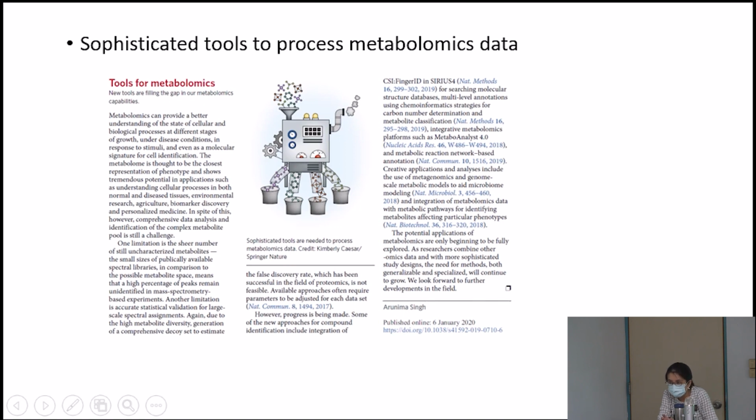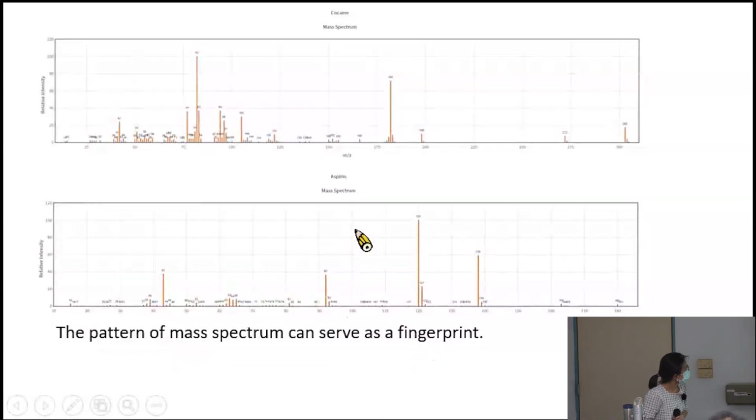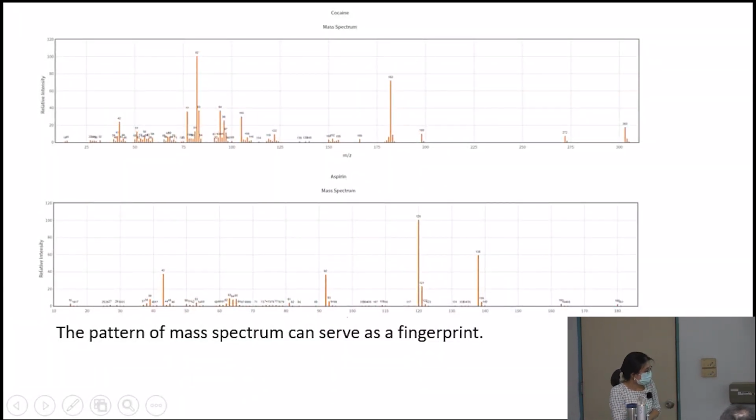Okay, so basically, I think I can use that cartoon figure to show you again. Here, you are asking if I have one sample and I was unable to match it with a different peak, how to determine the metabolite? Is that your question? Okay, so that means I need to have the standard curve here, and then we can understand what is metabolized.